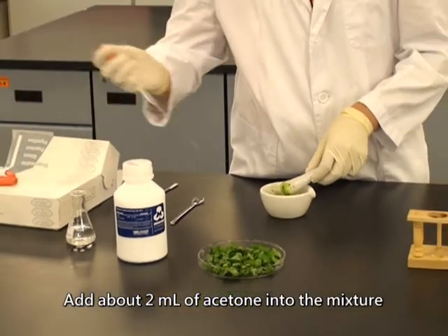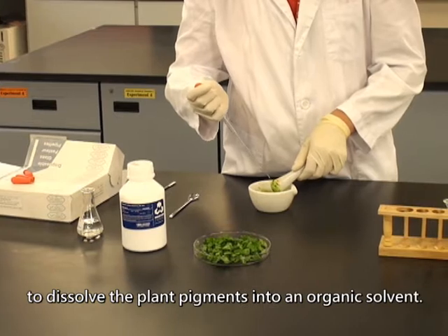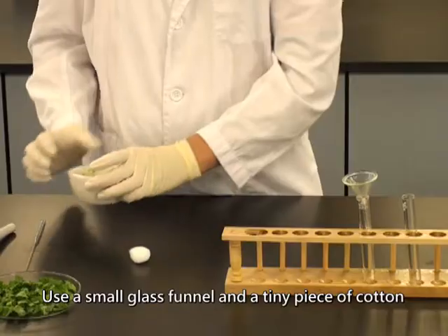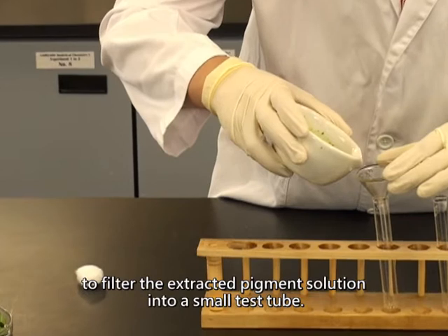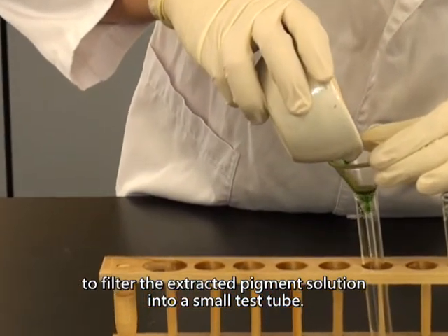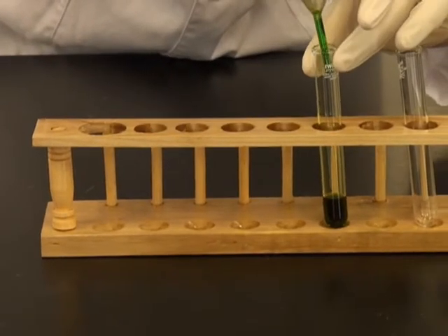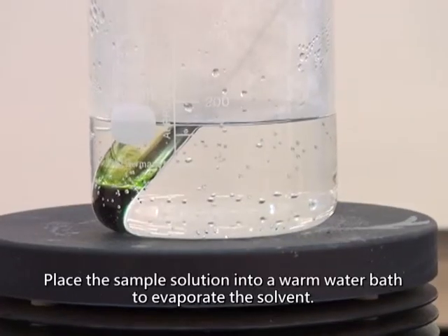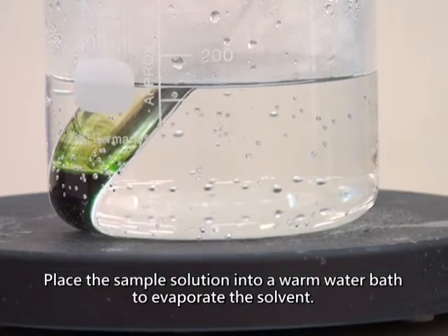Add about 2 ml of acetone into the mixture to dissolve the plant pigments into an organic solvent. Use a small glass funnel and a tiny piece of cotton to filter the extracted pigment solution into a small test tube. Place the sample solution into a warm water bath to evaporate the solvent.